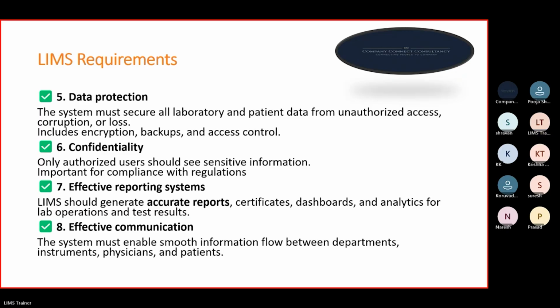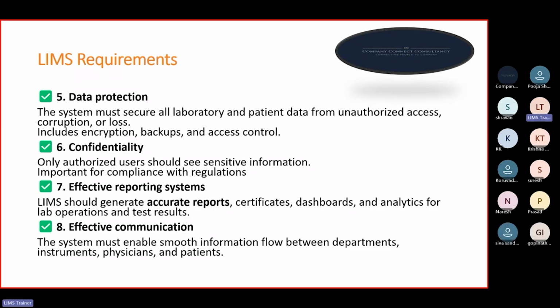The user access will be provided in such a way that only the team lead can assign tasks to different analysts. Each analyst can see only the work assigned to them in their login. After the analyst completes the data entry or result recording in the system, he will send it to the reviewer for review.